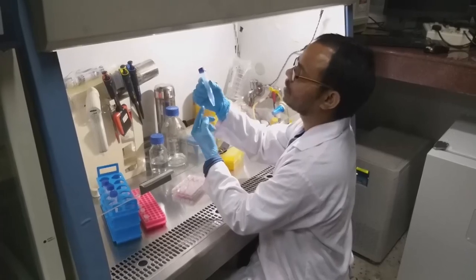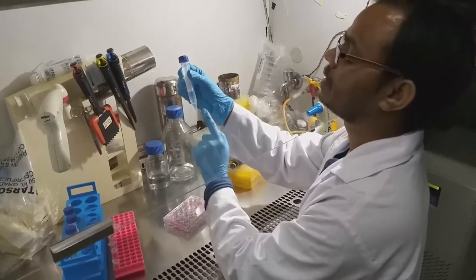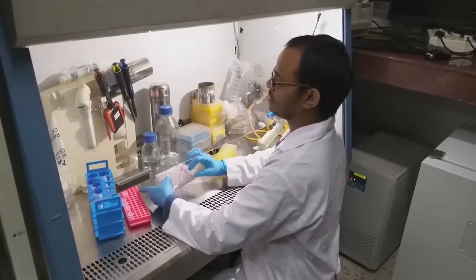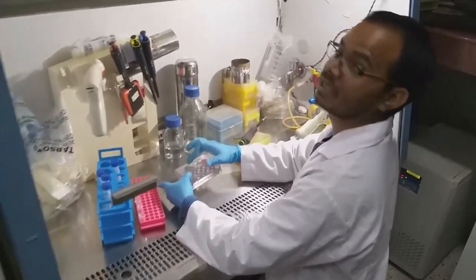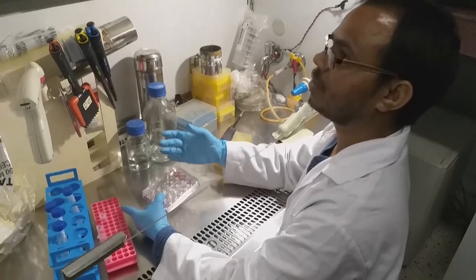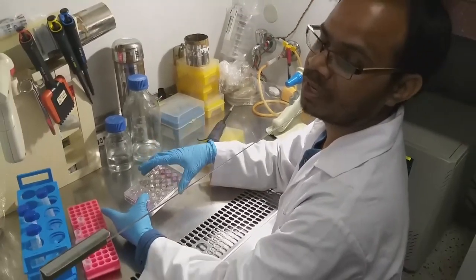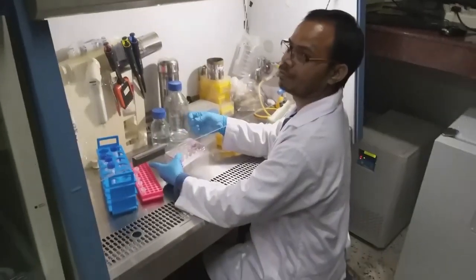After 5 minutes are over, we can see a visible white precipitate inside the tube. So I am going to add this complex directly to the cells. Here are the wells which contain reduced serum medium. If we add 10% serum, then it may complex with the PEI DNA complex, and then it may not get internalized inside the cells. So we should take care of that.